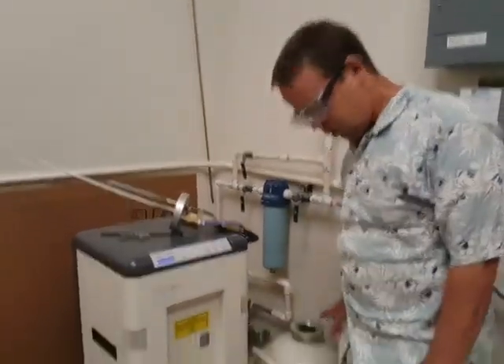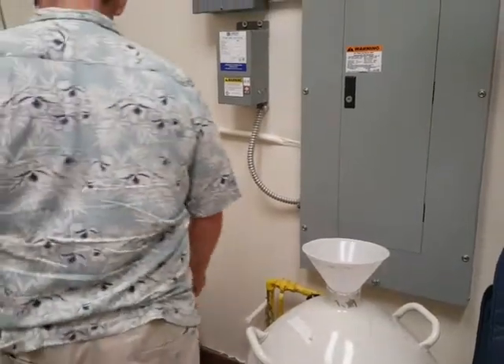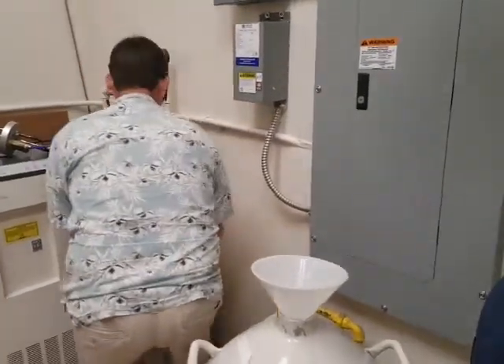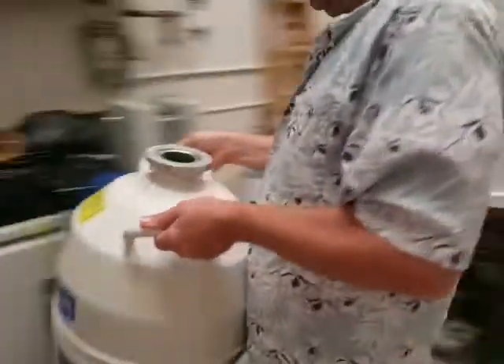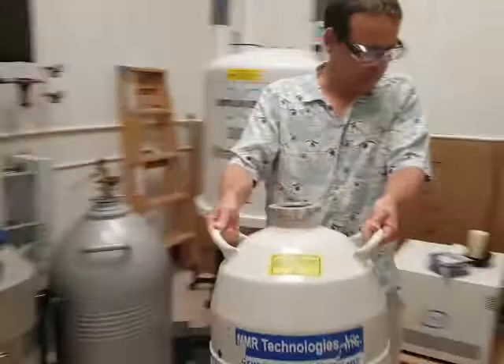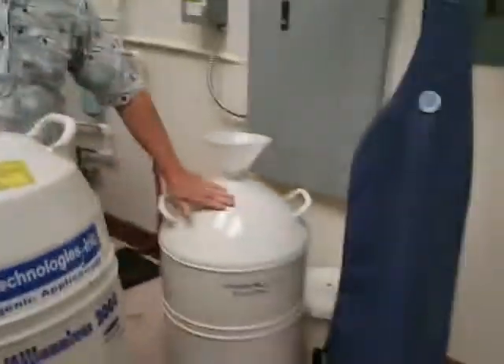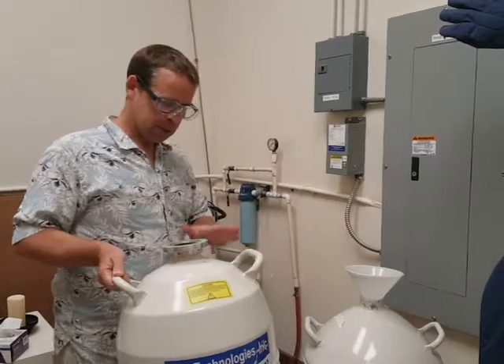I have this tank here, which I can deliver into anything that I want to deliver it into. I'm just going to deliver a little bit into here for now. We don't want to take liquid nitrogen from the larger vessel or any of the larger containers — usually the larger vessels are for keeping the mammalian cells frozen.